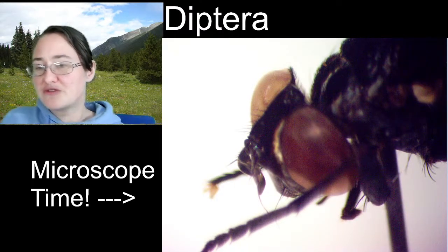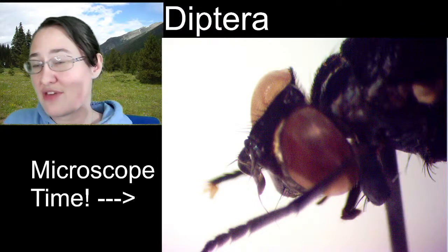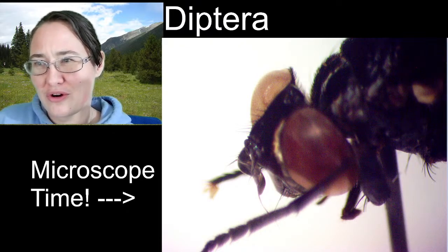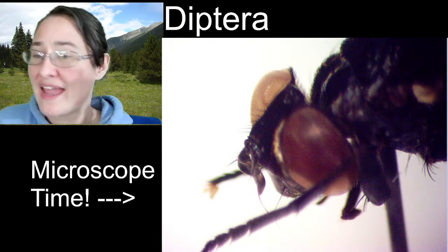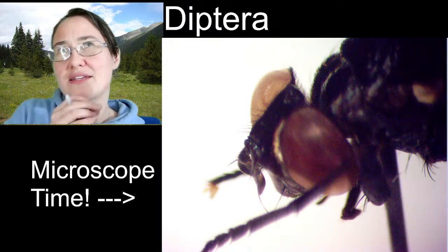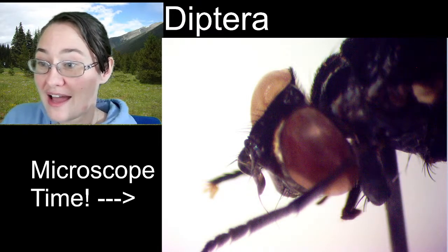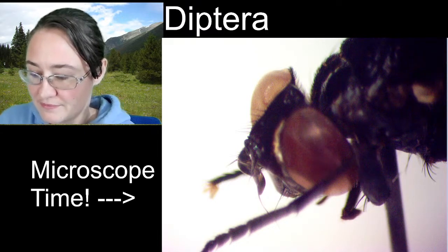And flies tend to have both hairs and then what we call bristles. We don't really use the word bristles for any other order, not that I can think of. And when we're saying hair with Diptera, a lot of times it's very, very thin and covers the entire body, like the hair on a golden dung fly. Oh, I've got a really cool picture of a golden dung fly here. I'll show you really quick.